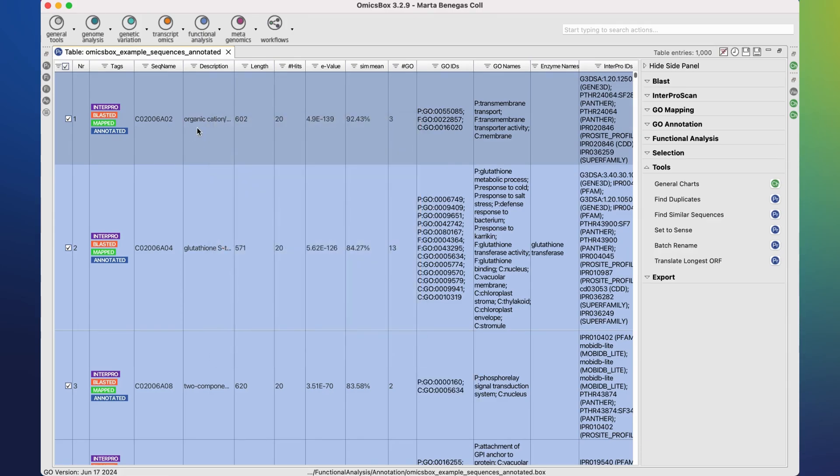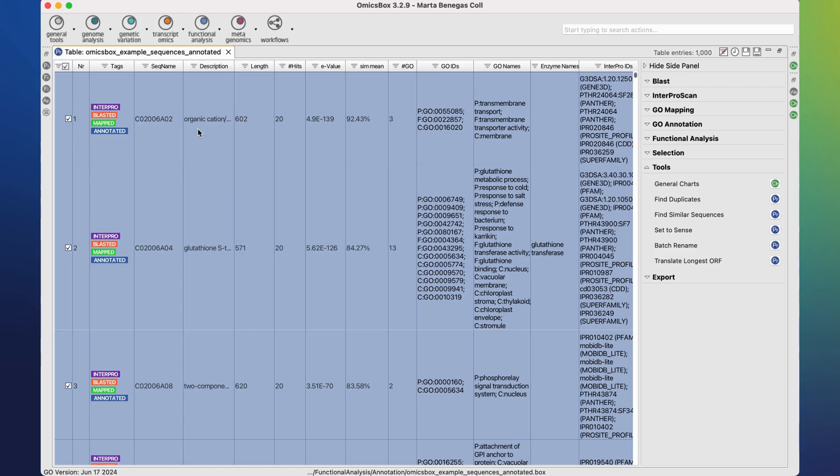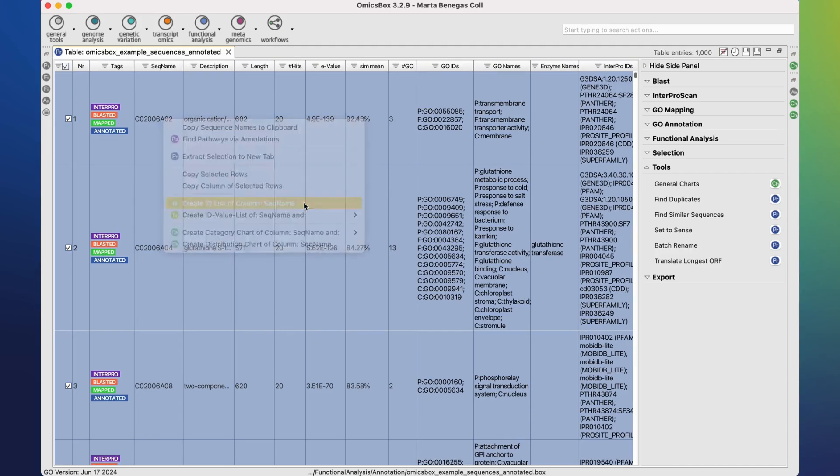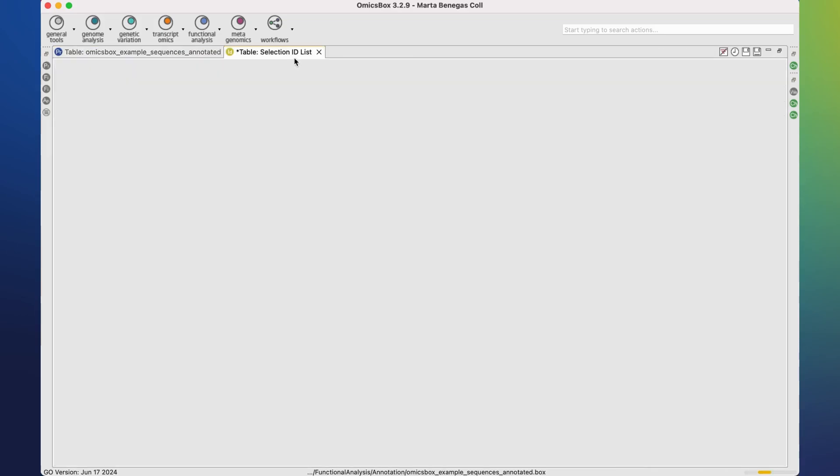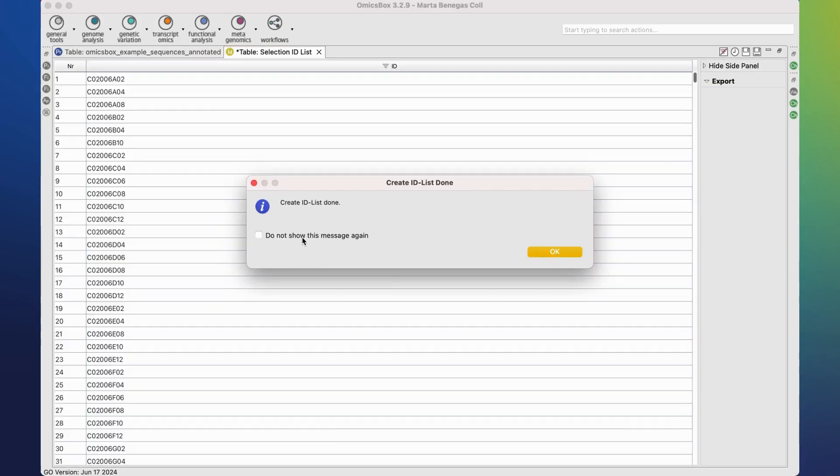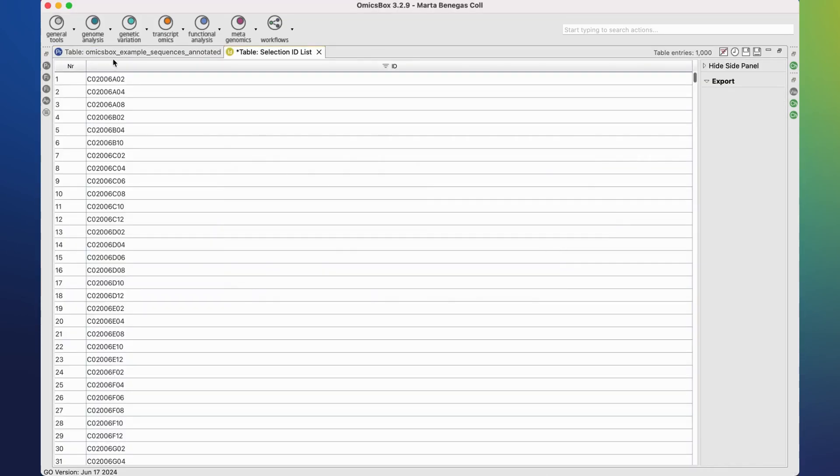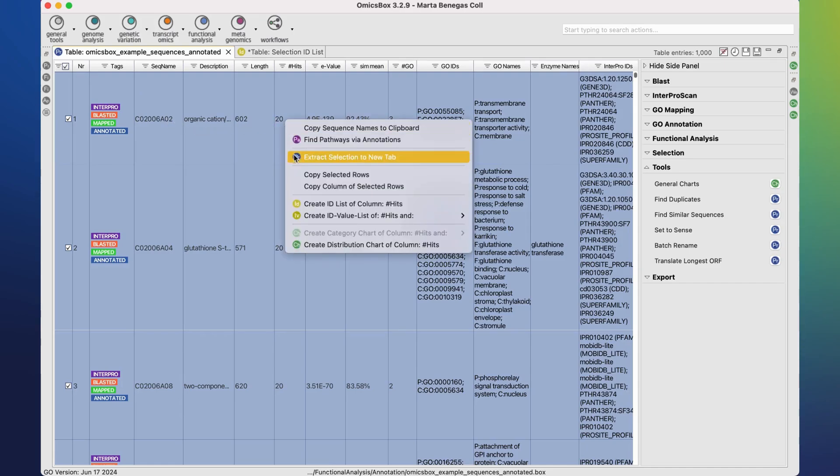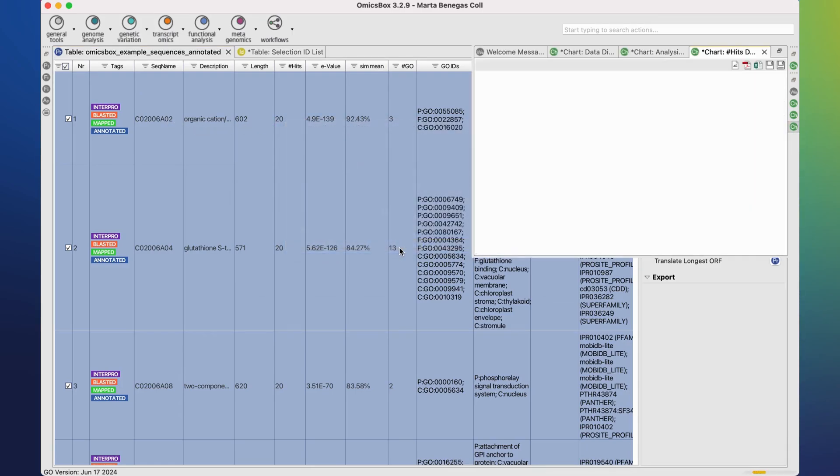It is possible to select all rows by clicking on Command-A in Mac or Control-A in Windows and Ubuntu. We can right-click on any row and copy and paste the content of this column or generate an ID list. We can also generate a distribution chart of the given column.